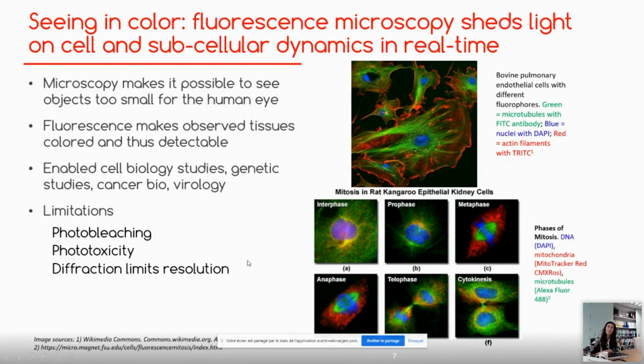And a big theme that we're going to see that is the main driver for the advent of super resolution microscopy is this physical property of light called diffraction. Light spreads through all media, and the bigger it spreads, it really limits our resolution.